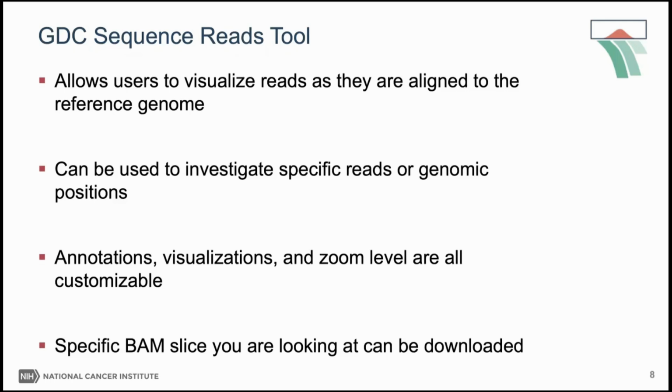And as I said, this is kind of like visualizing a BAM slice, and whatever you are looking at in the tool can actually be downloaded using the tool. So that is an option there.